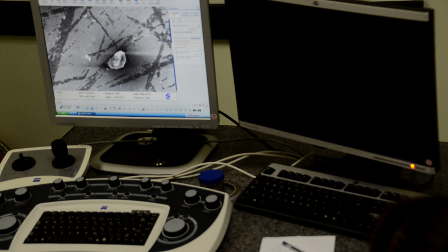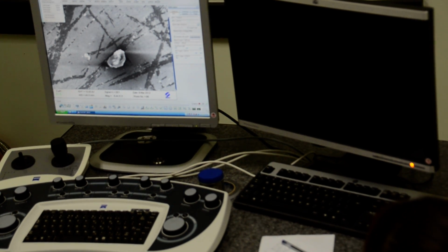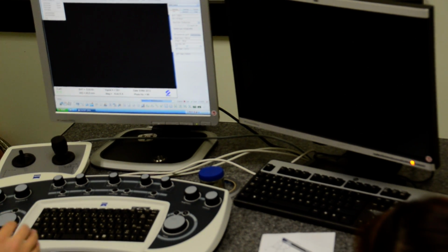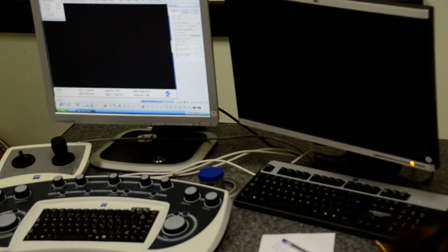I think good, because just now we created the username. Everything is saved inside the default. So that's why even if I change something just now, it still goes to the default section. I want to log out, log in again.